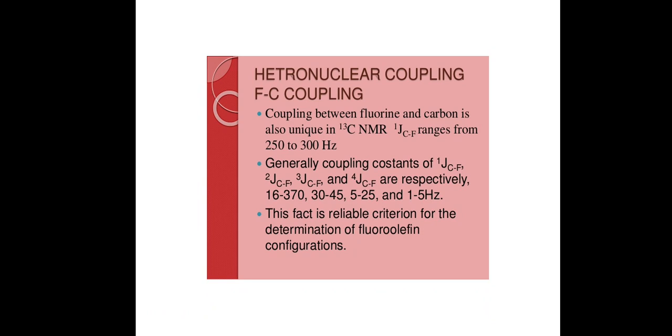Next, we discuss the applications of Fluorine-19 NMR. Organofluorine compounds and consequently F19 NMR have very important roles in research at the chemical and biological interface. In addition to direct applications of organofluorine compounds that are used as pharmaceuticals and agrochemicals, they are employed as probes to explore enzyme mechanisms, metabolic pathways and biomolecular interactions.